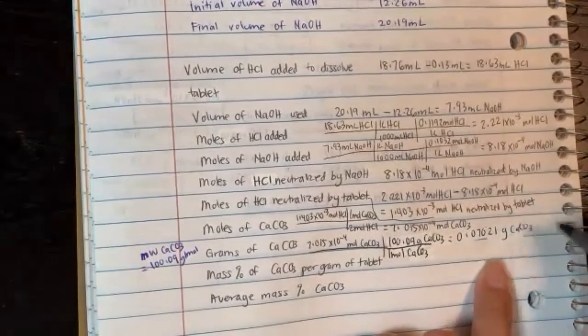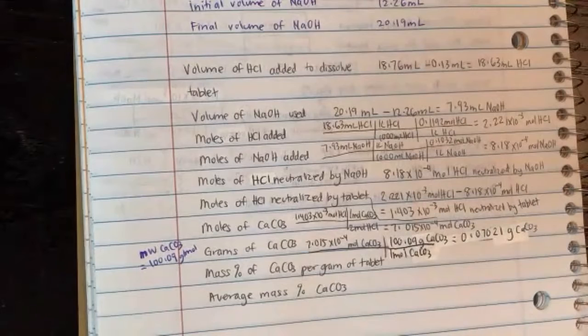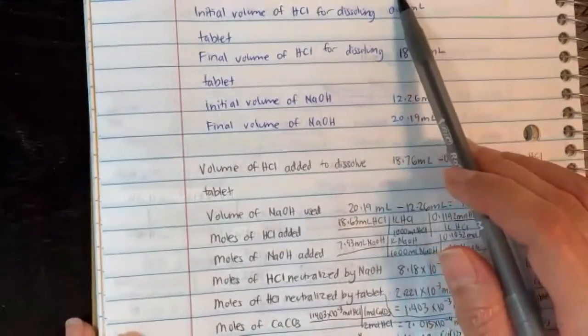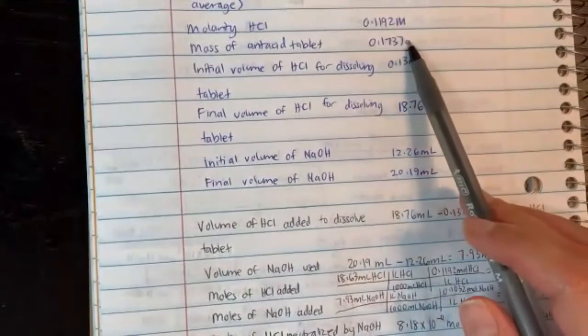So then if we have the grams of CaCO3 and we have the total grams of the tablet, which is up here in our data, 0.1737 grams, okay?